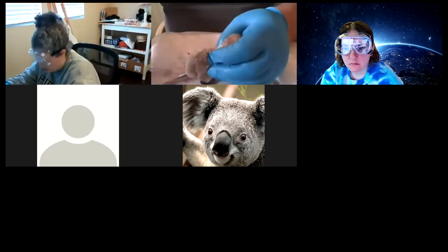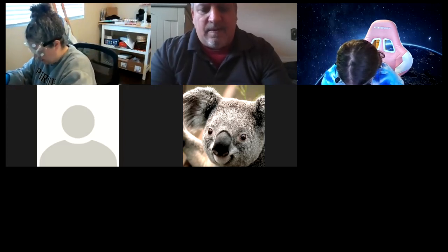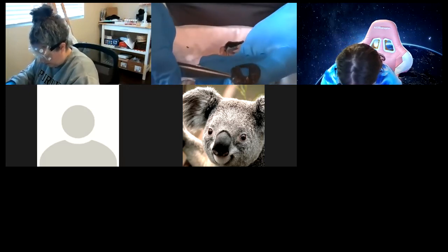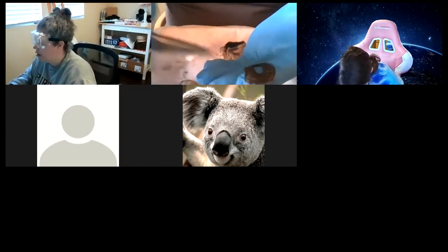My tapetum lucidum came out when I removed the vitreous humor — that's a cool part. You can still see the color. One other part I forgot to mention: around the iris, there are actually fibers of retina — that's called the ora serrata. That's just one other structure. These are the things we have in lab all the time.